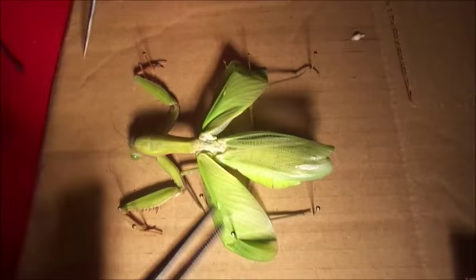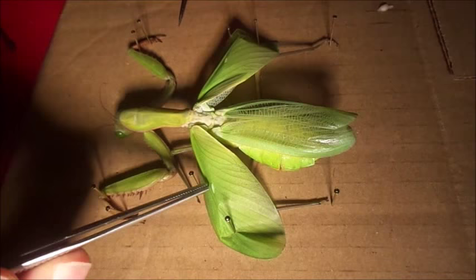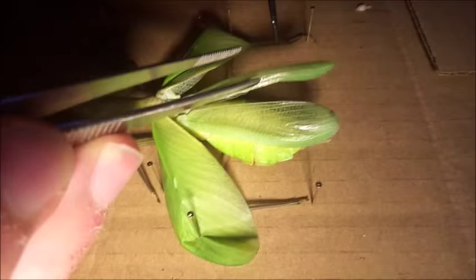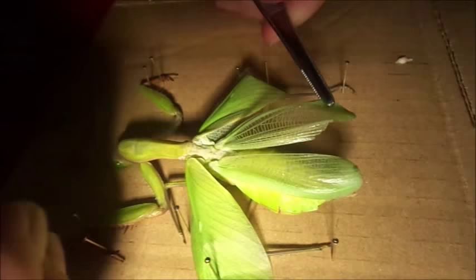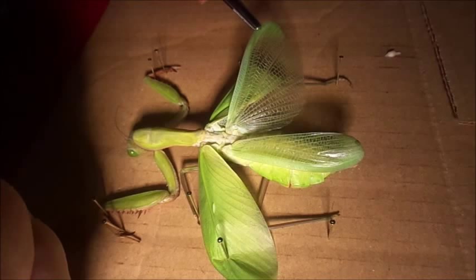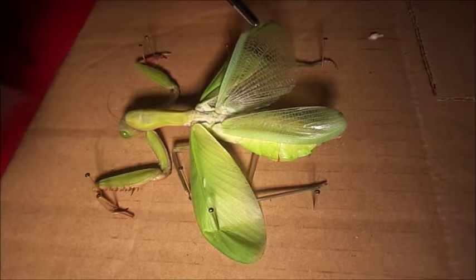You can see I've pinned out the wing covers. On the inside you can see the flight wings, which are much more delicate and gorgeous. They fold up quite a way, but if you actually fold them out, they are very decently sized. I'll take a pair of forceps — that is the wing surface they have to fly with.